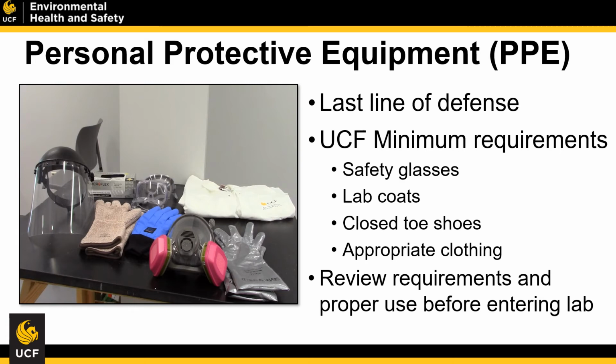If you're working in a biological lab, we're going to ask you to wear a lab coat that buttons all the way up to your neckline, so that we minimize your exposure to pathogens.